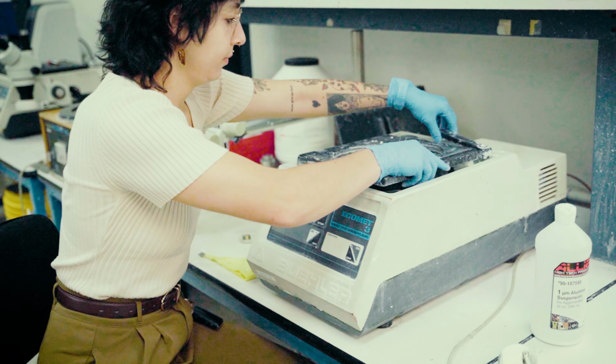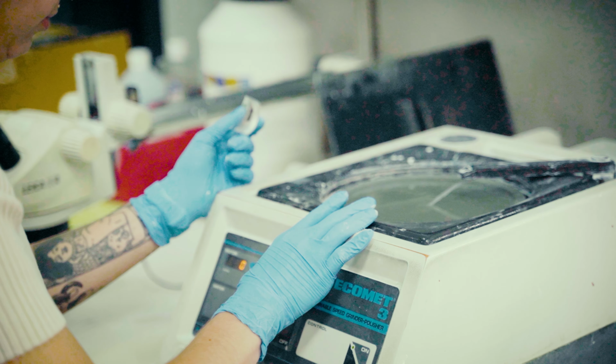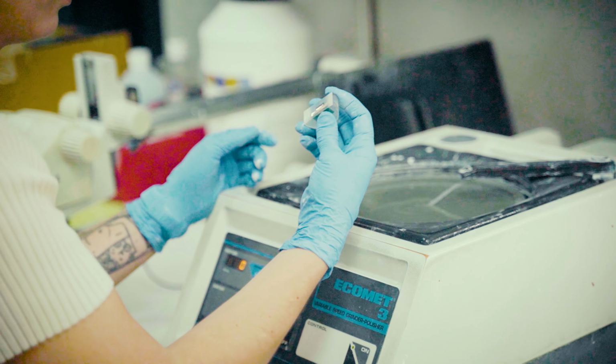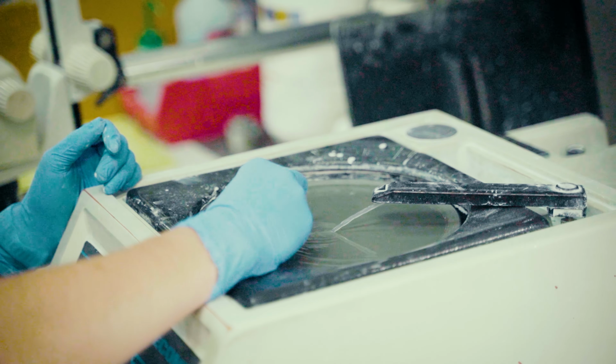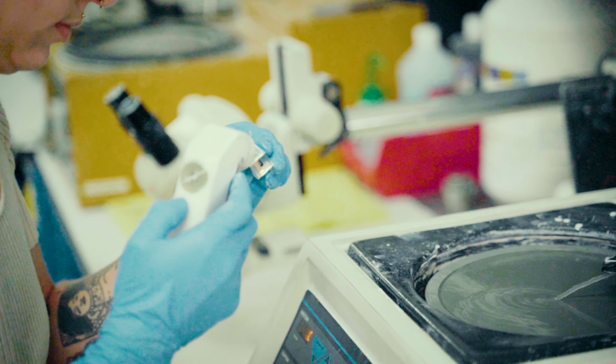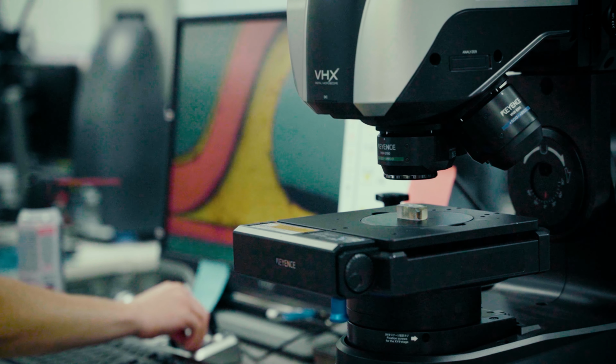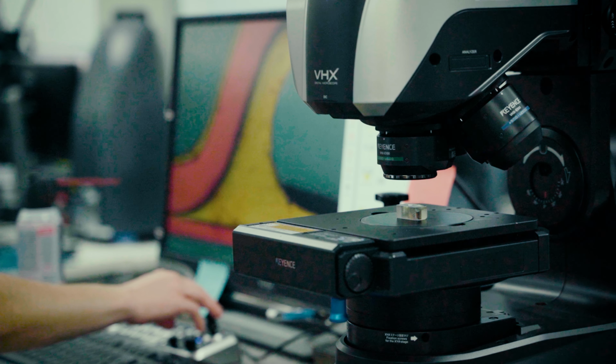So first, in our analysis, we started by doing a mechanical cross-section of these power connectors and looking at the through-pin components. We first cut them on a diamond wire saw, and then we used various polishing wheels with silicon carbide polishing discs to get it nice and polished so we could put it then on our Keyence VHX to get images to provide to the customer. In our analysis, we found that there was delamination between the through-pin connectors of these power connectors and the PCB. This can cause an issue because it can cause poor connectivity.